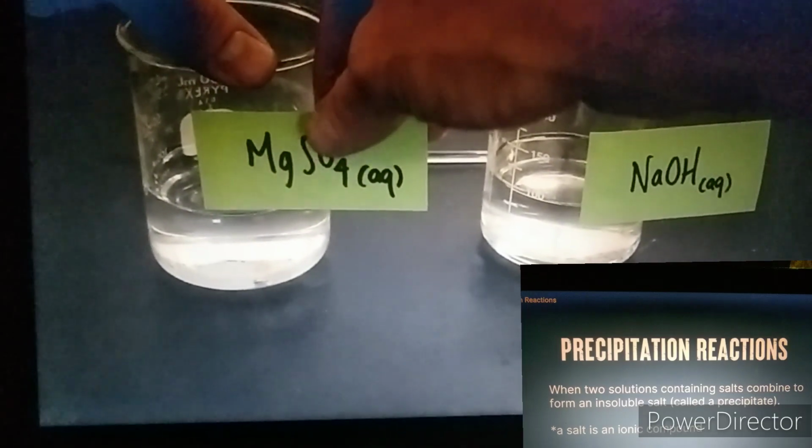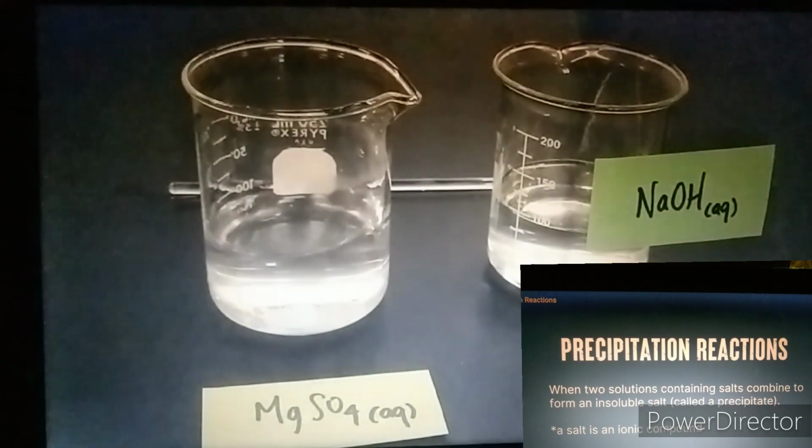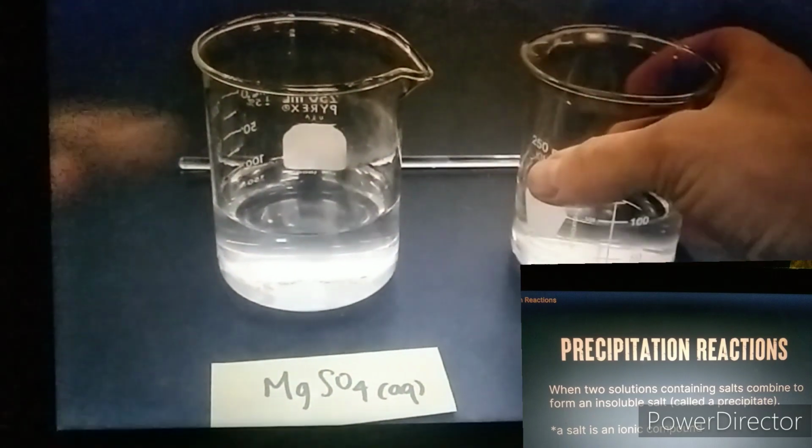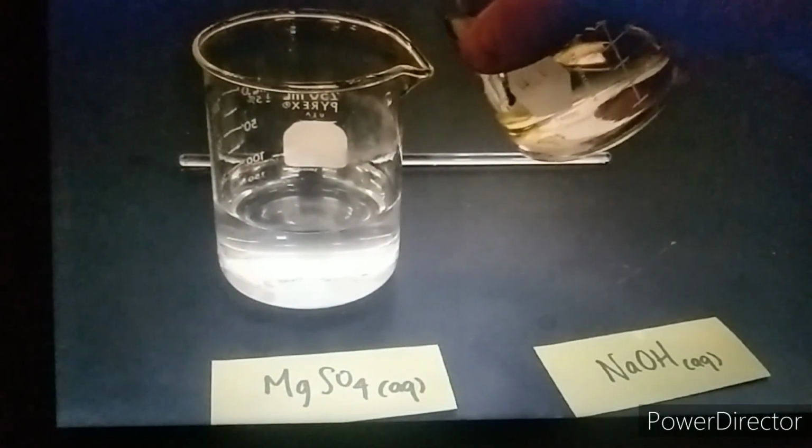Contain a dissolved aqueous ionic compound. In the beaker on the left, we've got magnesium sulfate. You can see that that is a clear and colorless solution. Looks just like water on first glance. And over on the right, we've got sodium hydroxide, which is also clear and colorless. Again, looks just like water. And what we're going to do here is we're going to mix these two and see what happens.